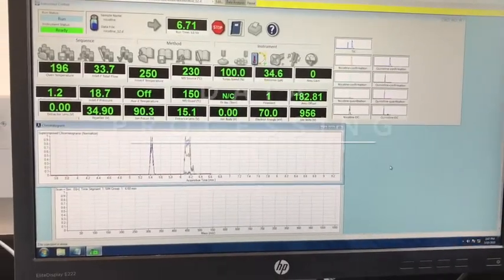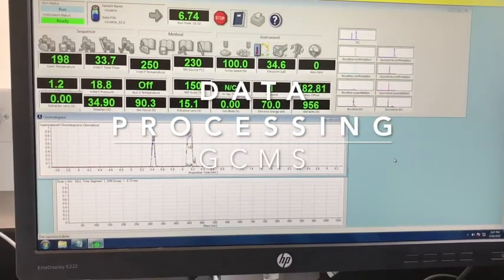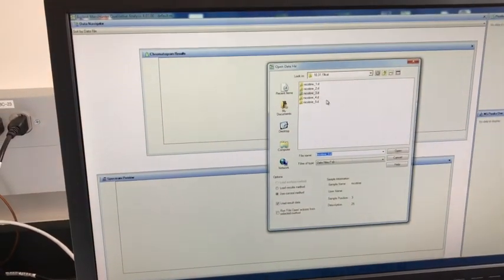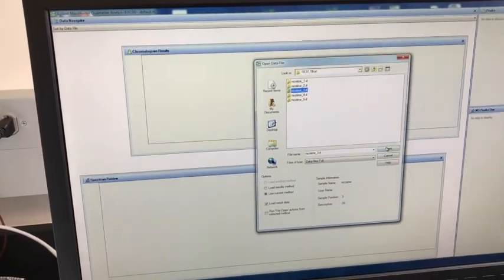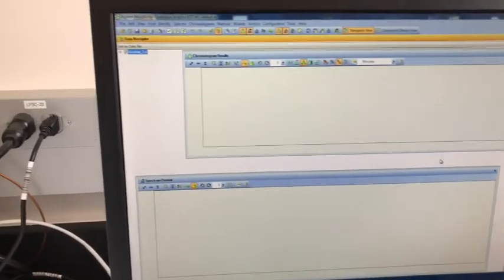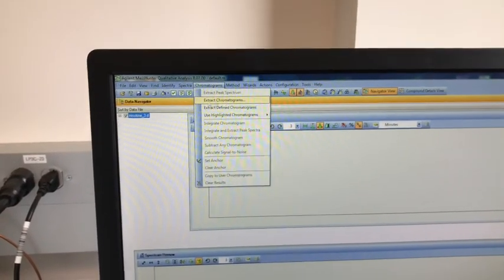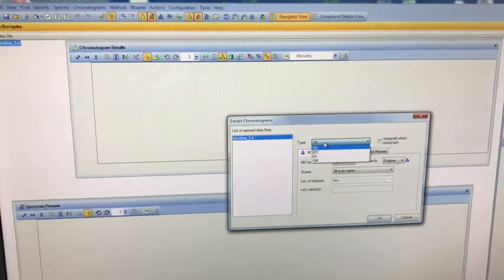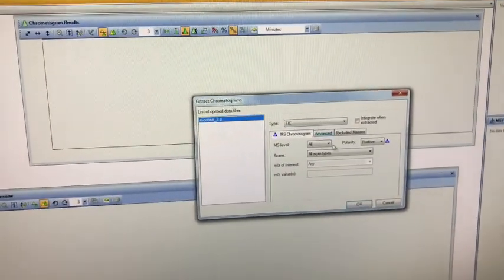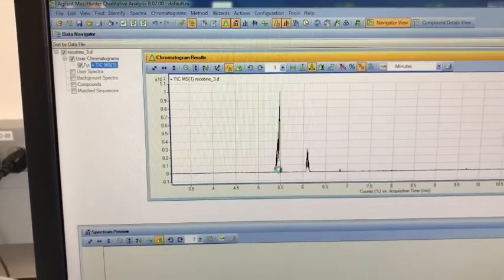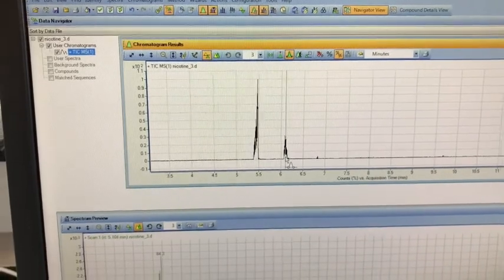Once we are done with the run, we've got to process our data. We minimize the acquisition window and open the qualitative analysis window to process our data. We choose the sample we want to analyze, then go to Chromatograms, Extract Chromatograms. The first chromatogram we want to extract is the total ion chromatogram — the TIC. If we click OK, we'll see two peaks: one for quinoline and one for nicotine.